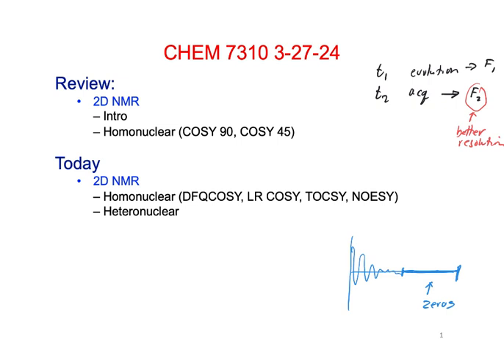There are different types of weighting functions that you can apply to the data to change slightly the shape of the peak. Like they have a Lorentzian multiplication and a Gaussian one, and some of them come down more like this, and I think the Gaussian comes down more straight and then flattens out here, so you can get better resolution near the bottom of the peak.